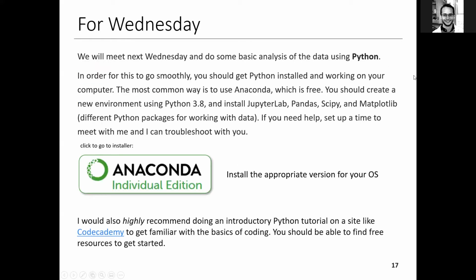So moving on to the Python stuff. A couple people said they were able to get Python installed. So has everybody at least installed Anaconda, and maybe not created the environment yet? If not, then why don't we go ahead and do that now? I think it should work for everybody. I'm a little worried about, is it Lily who has Windows 7? We might be able to figure something out with that. So let's go ahead and do that, and then we can troubleshoot the Anaconda installation together.